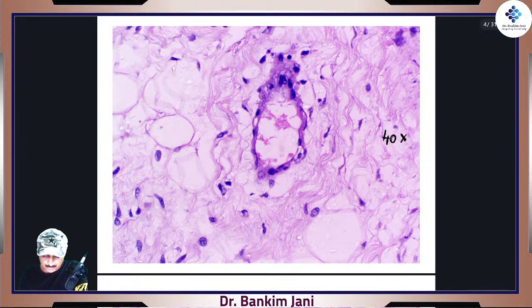And now we can appreciate that, see, these are the cells. The cells look like this, right? These nuclei look flat. See the nuclei. Classically, the nuclei are literally flat, right? This is amongst all those soft tissues. There is fat and there are some other connective tissues. So we are learning piece by piece.